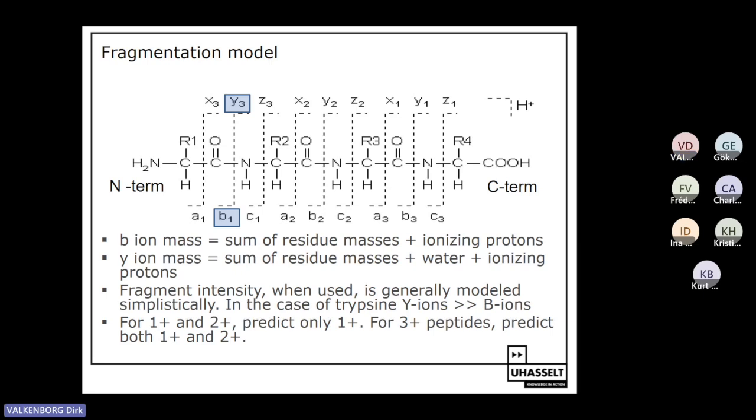And this is the heart of what we will do: we will create a virtual spectrum based on the text, the peptide sequence. How we will do that when we do CID fragmentation. We know very well how this works, and CID fragmentation will further disassemble a peptide sequence, but this time in the gas phase, and it will break the peptide bonds.